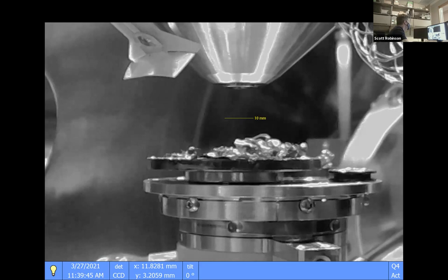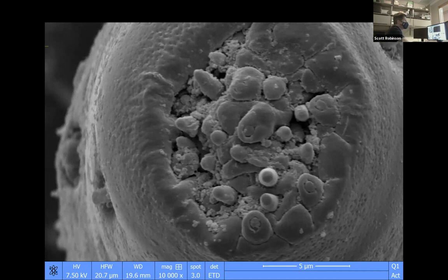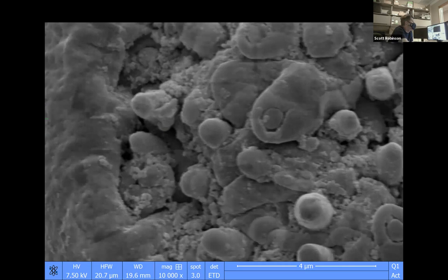So if we look at the palp on this insect right here, these are little sensory features that help it taste its food. And those are about 5 microns. The little window that I have on there is about 5 micrometers, which is about 5,000 nanometers in diameter.